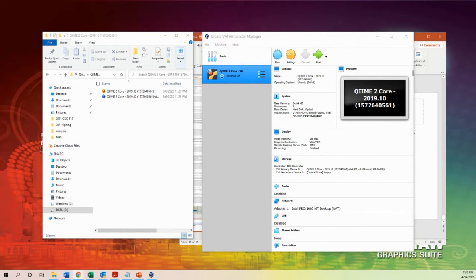Under NGS 578 NGS analysis? It's still uploading, because the big file is still uploading. It's uploading to the platform now. Just wait a little. Okay, no problem. Okay, good.